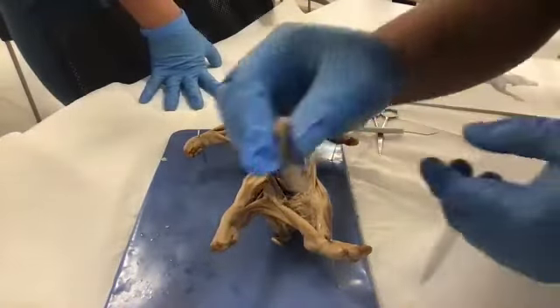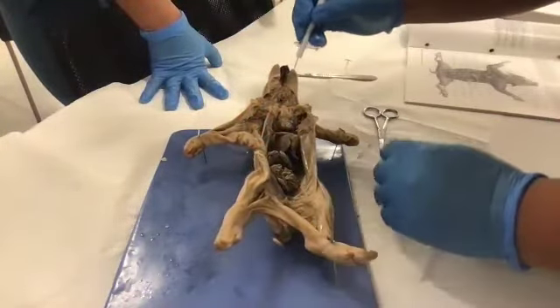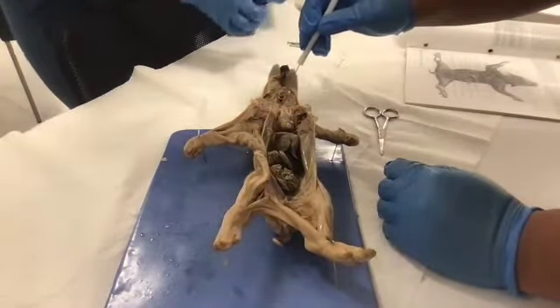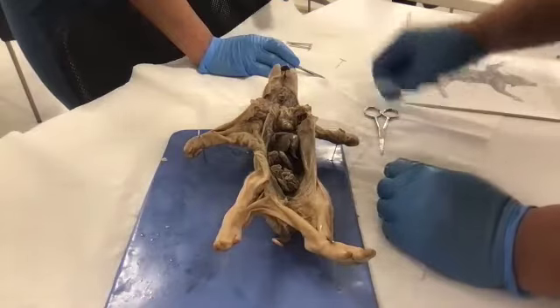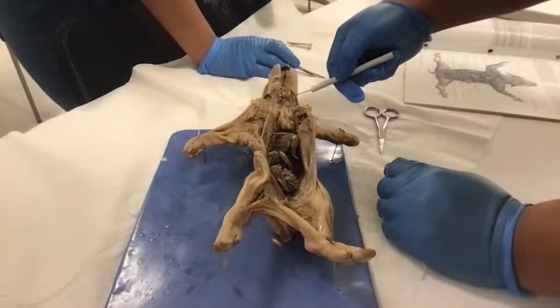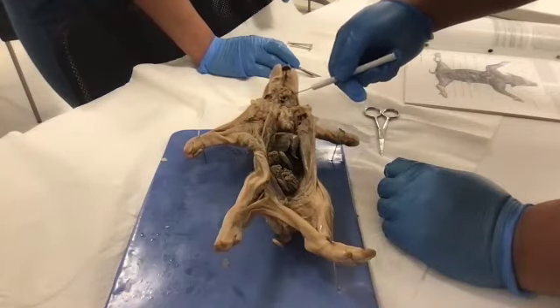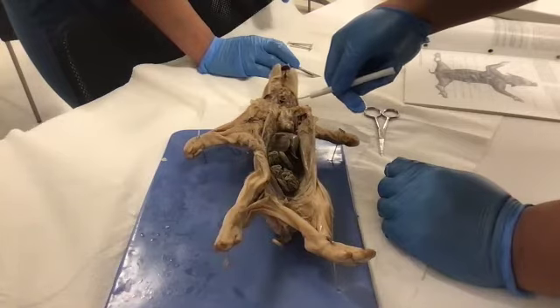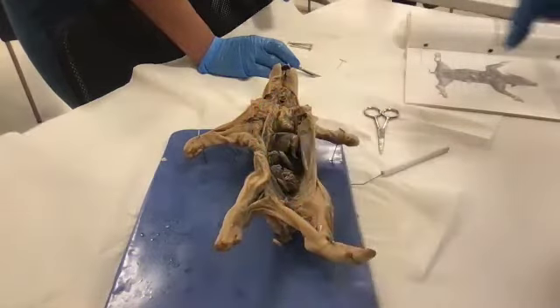So if we're looking at this thing, the first thing that we see, and she cut a little low, I should have told you to cut a little higher. You see this? This is like a little flap that will cover this. That's your epiglottis. So you have one hole or one tube, that's your trachea. That's your windpipe, that's going to go to your lungs. Then you have the hole down here, that's your esophagus, your food tube. So your trachea is anterior, the esophagus is posterior, and then when I am drinking or eating, this little flap is going to close this area right here.